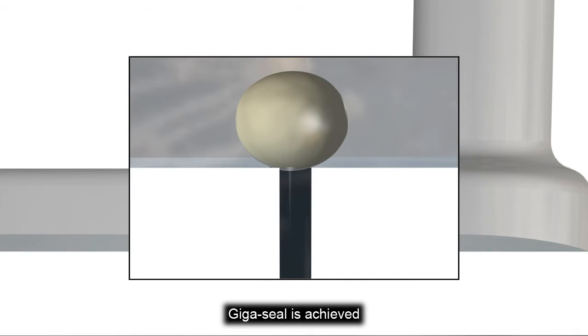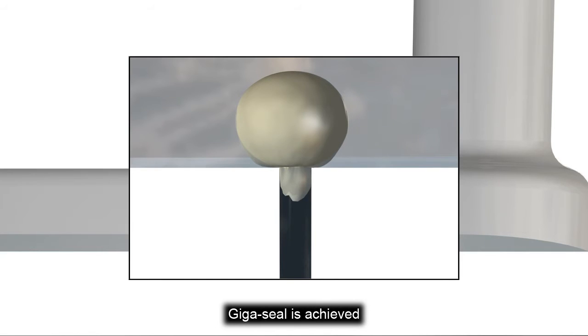First, a Gigaseal is achieved and then additional suction ruptures the membrane to create the whole cell configuration.